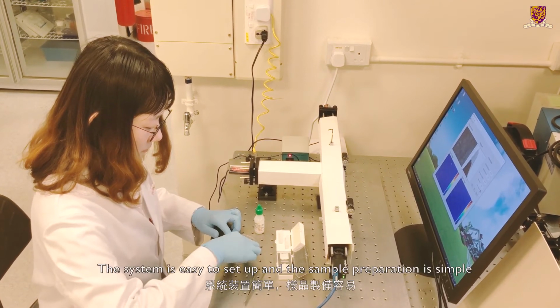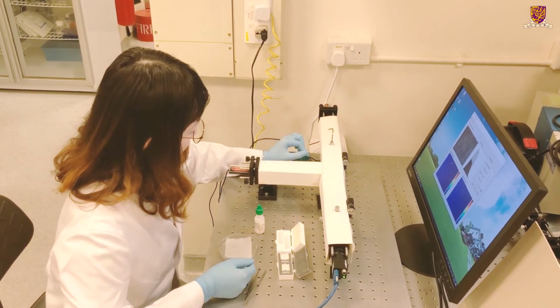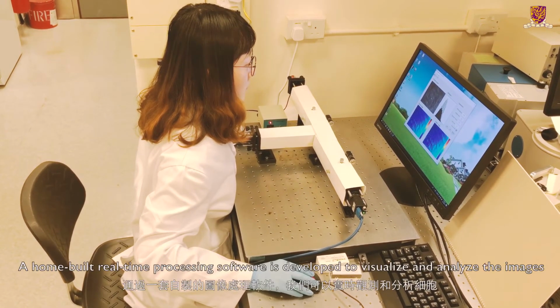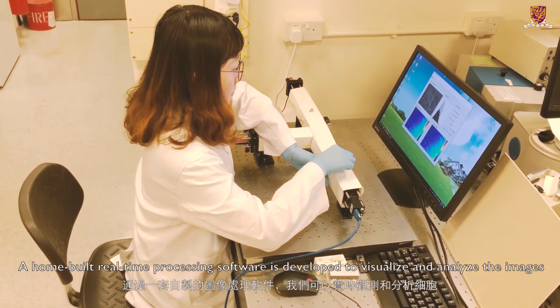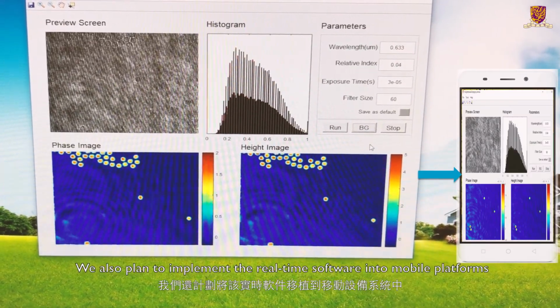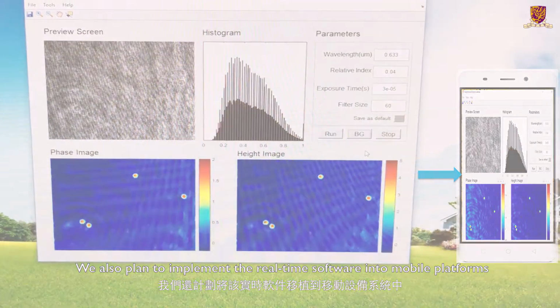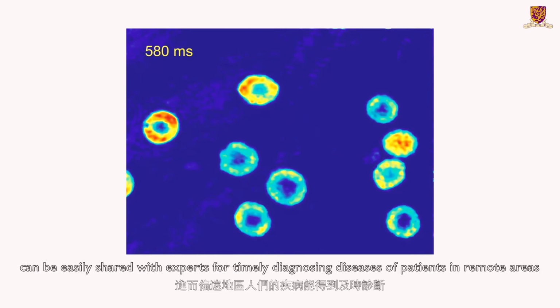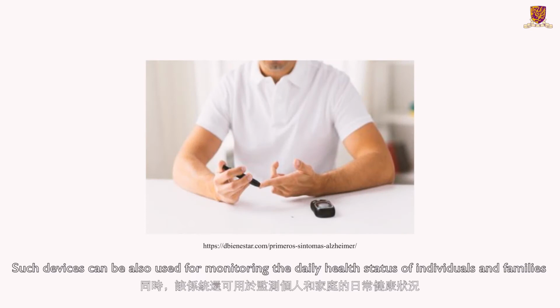The system is easy to set up and the sample preparation is simple. After preparation, we mount the sample in the system. A home-built real-time processing software is developed to visualize and analyze the images. We also plan to implement the real-time software into mobile platforms, so that the imaging data, such as red blood cell morphology, mechanics, and so on, can be easily shared with experts for timely diagnosing diseases of patients in remote areas. Such devices can be also used for monitoring the daily health status of individuals and families.